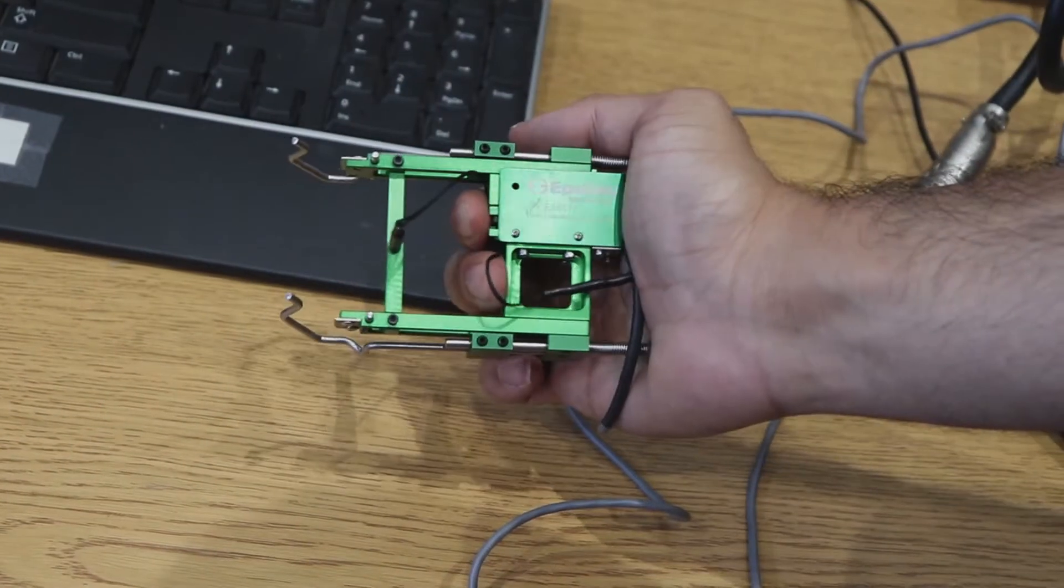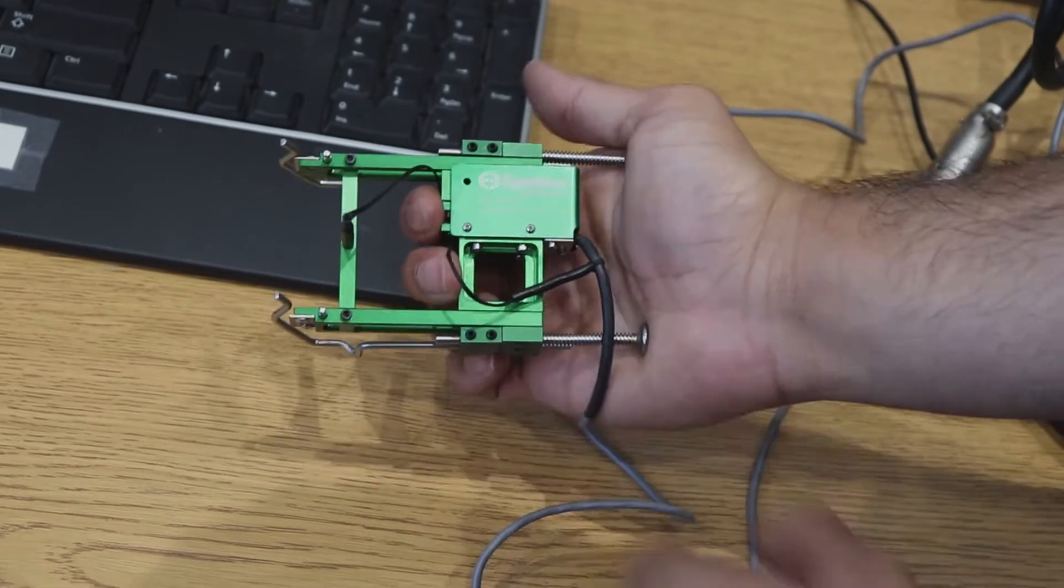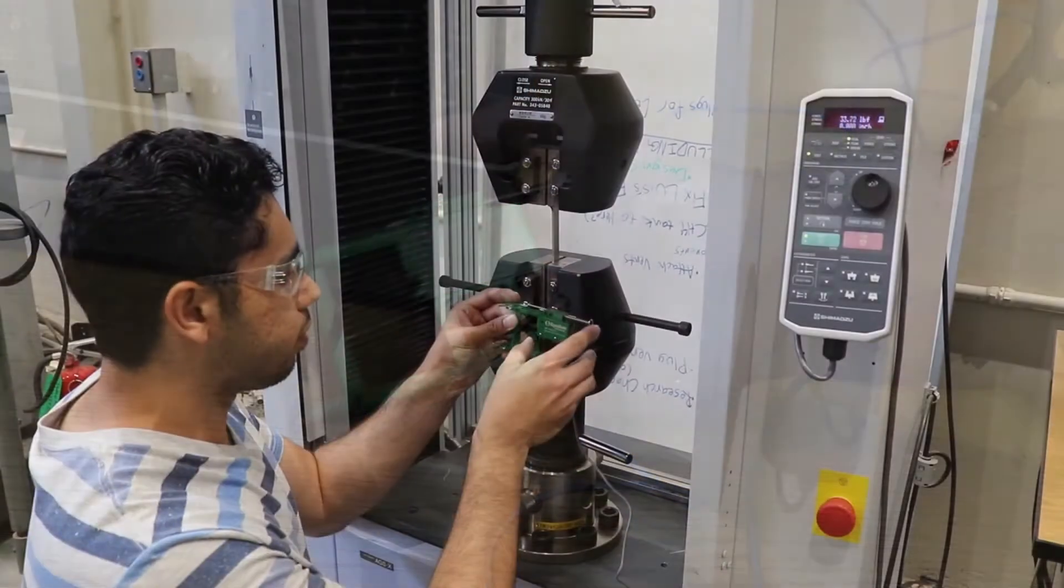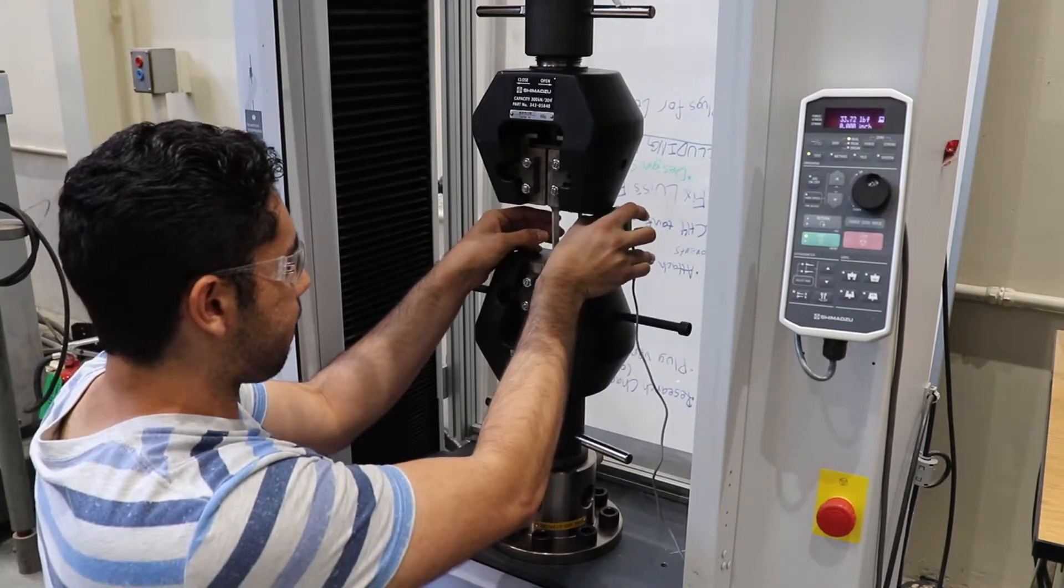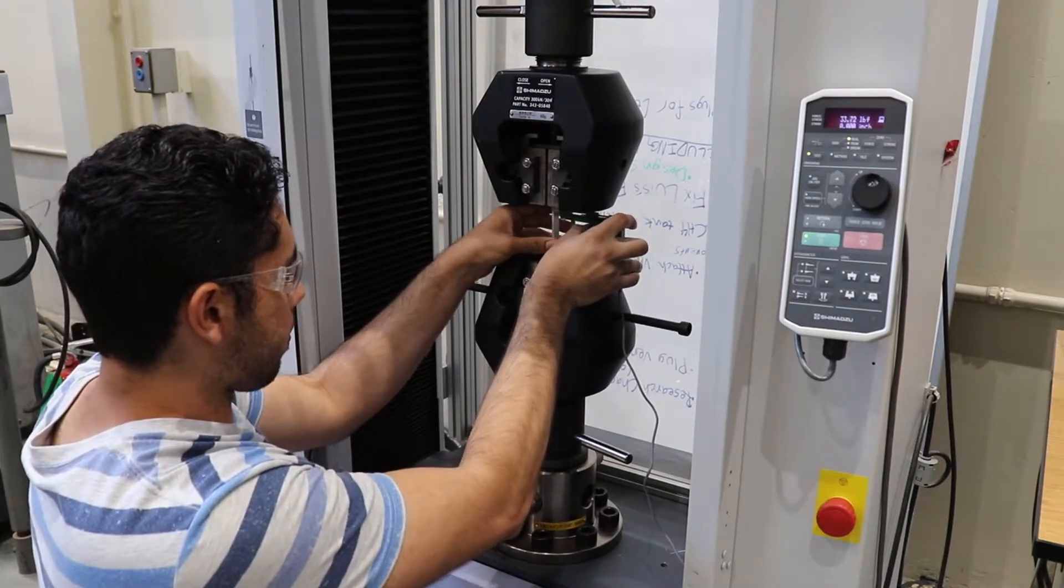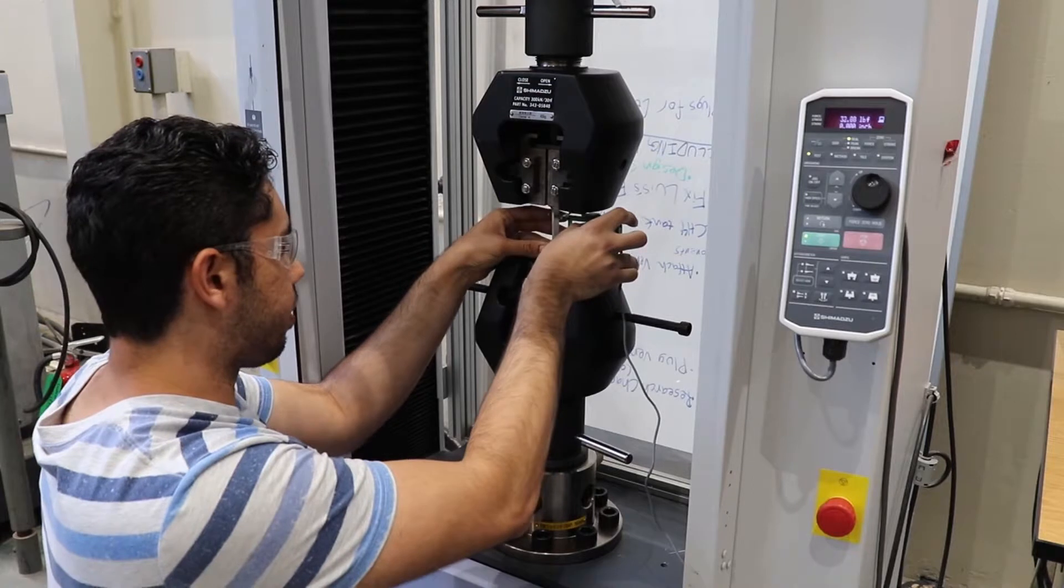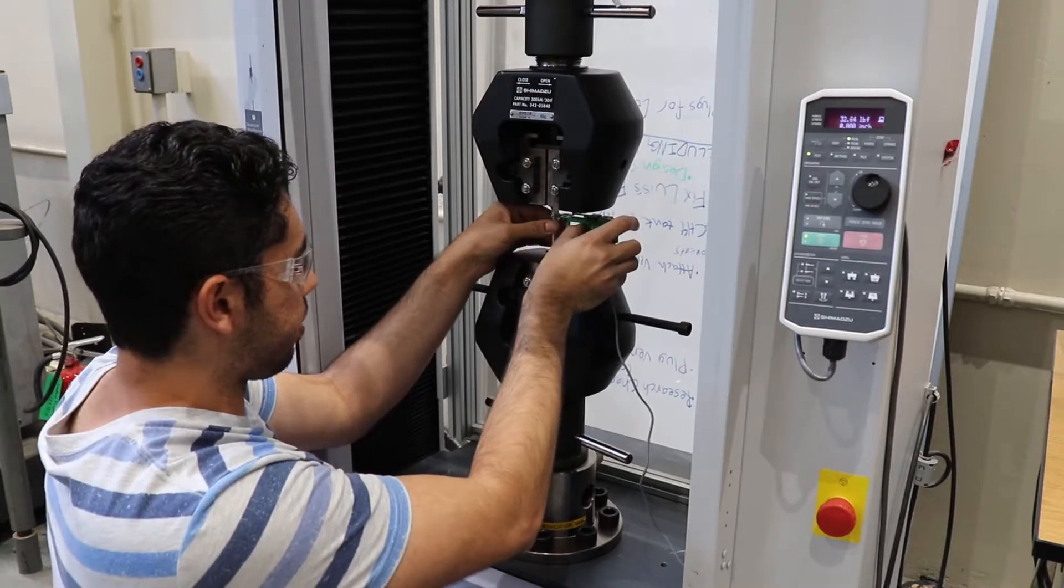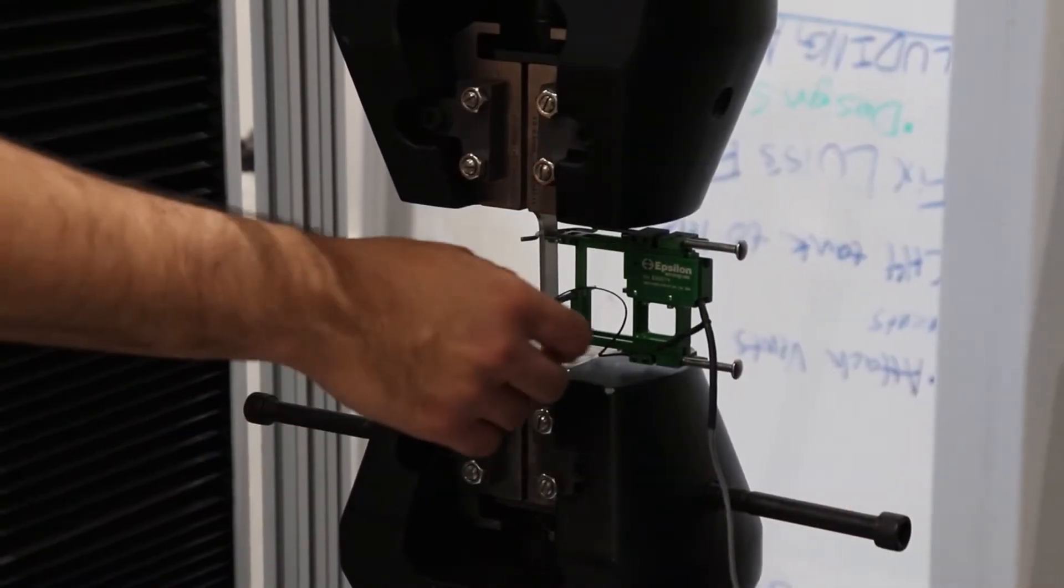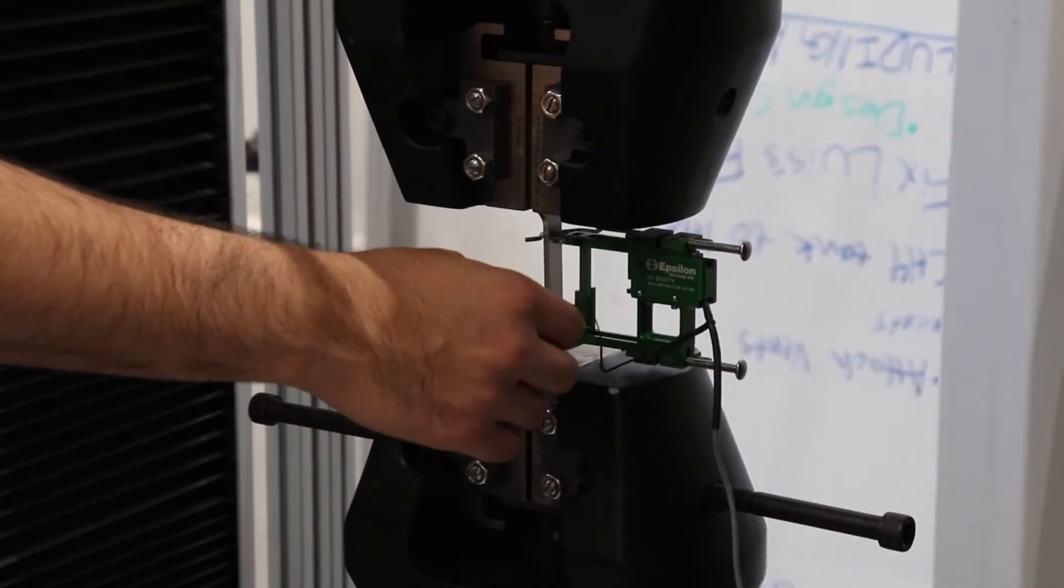Now that our specimen is preloaded, we can attach the extensometer. We attach the extensometer to the two-inch section in between the jaws. Now we can pull the pin on the extensometer and set it aside.